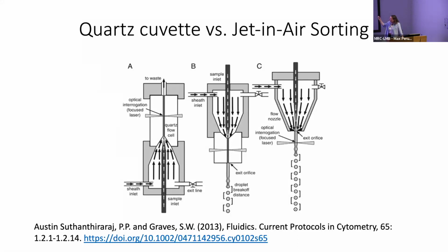And then at the moment the cell, or the cell of interest more specifically, is placed into a drop, that cell is actually charged. Then it passes through the middle of a series of high voltage plates. I don't have a picture of the plates.